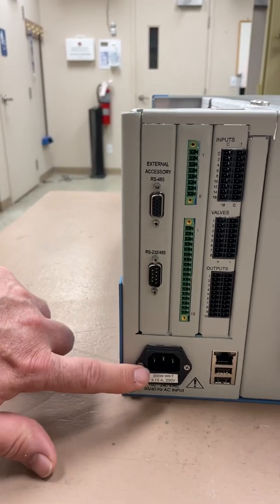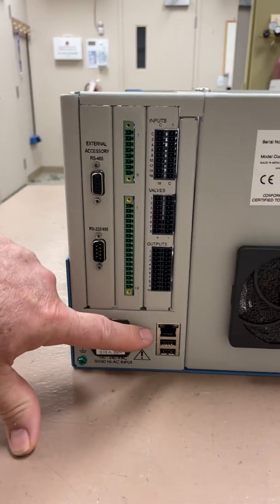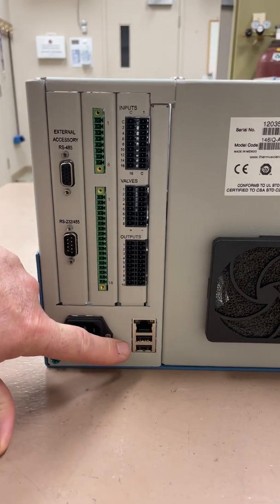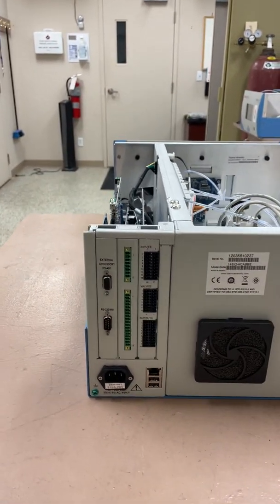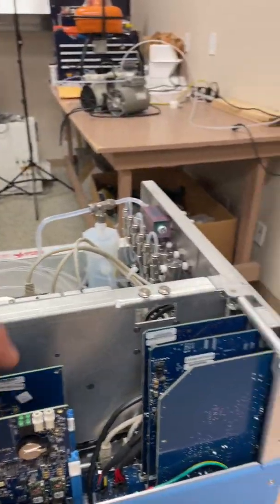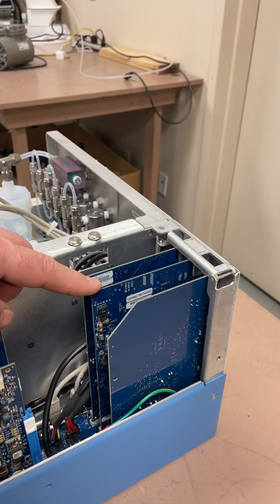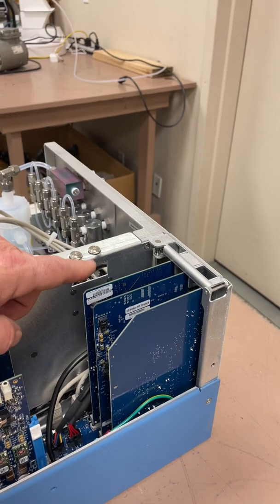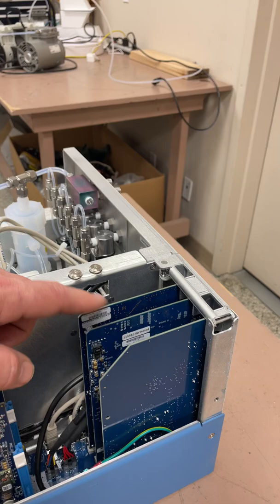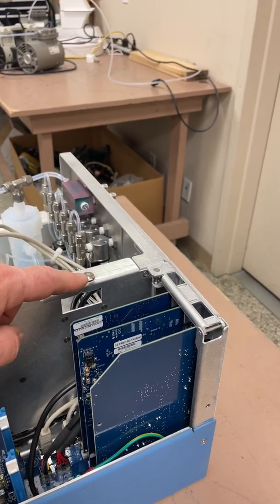On this side here we have various valve connections, outputs, lots of interconnectivity — analog outputs, RS-485, RS-232, a power connector, and a fuse drawer for protective fuses. Over here we have the standard Ethernet Modbus port and two USB ports, so there are lots of ways to get data off of this unit. Coming around the side you can see the cards that connect for digital inputs, analog outputs, RS-485, and Ethernet Modbus. These are optional — you don't have to order them if you want to save money, because the unit does come standard with the Ethernet Modbus port.